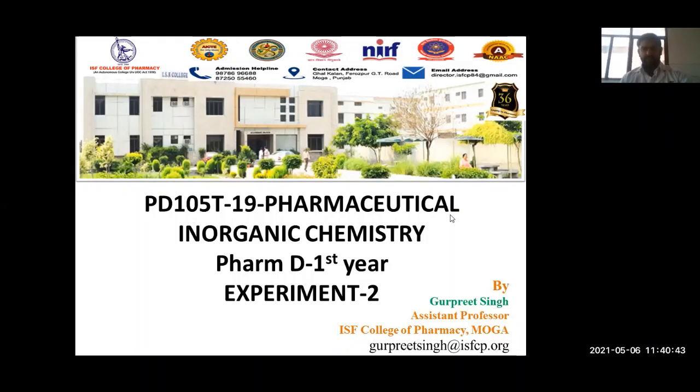I, Gurpreet Singh, working as assistant professor at the Department of Pharmaceutical Chemistry at ISF College of Pharmacy, am here to demonstrate another practical of pharmaceutical inorganic chemistry. This experiment is for PharmD first year students, and this is our second experiment in the series of online practical demonstration.